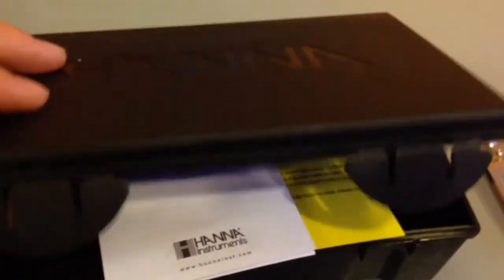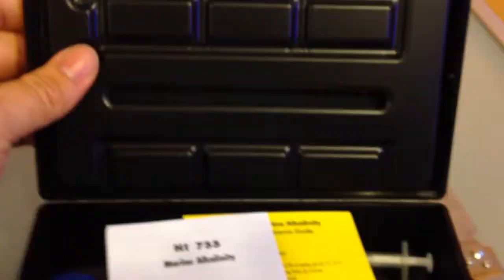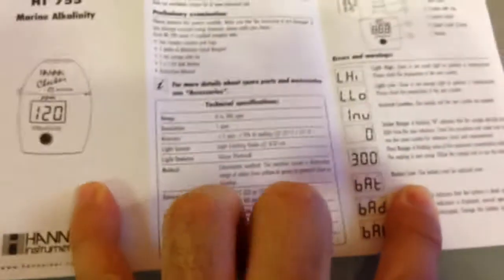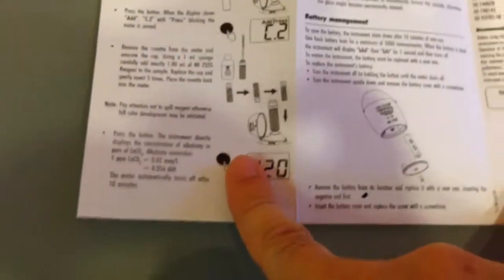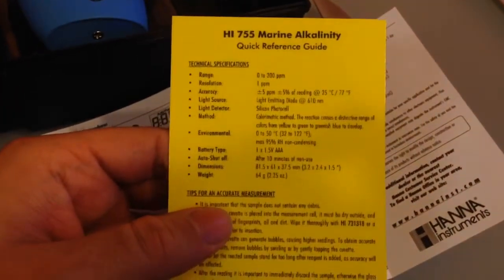What I'm going to do is just read the instructions and figure out the shortcut, so I don't have to read the thing over and over. Then I'll print them out and stick them on the inside of the box. This looks pretty nice. Here's the manual telling you different things. Here's the instrument measurement procedure — instructions for measurement. And here we have this card: 755 Marine Alkalinity.